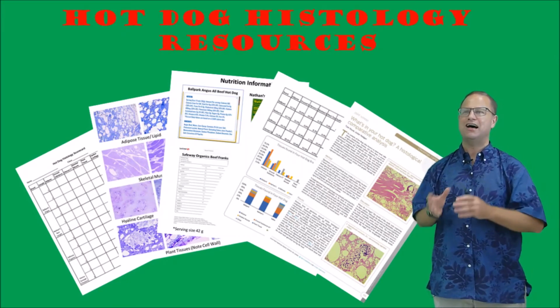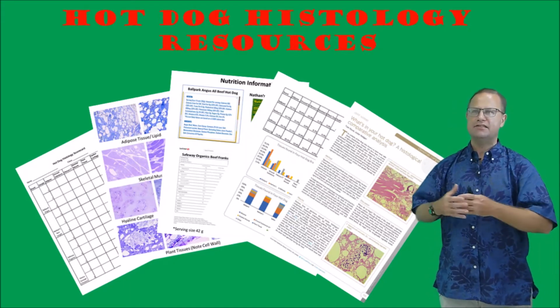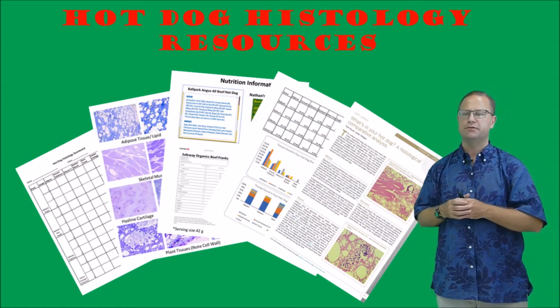That is, what is inside a hot dog? And these people actually went out, sectioned hot dogs, and then analyzed them in a manner similar to what we're doing today and actually published scientific papers on those.